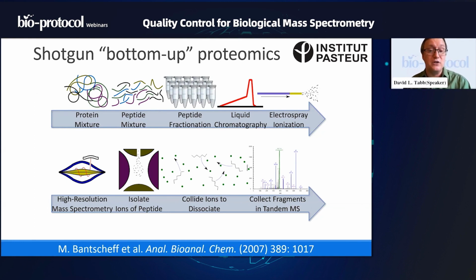And usually the trypsin reaction is around an 8-hour experiment or an overnight reaction. Once you've done that, you've gone from, let us say, a protein mixture of 10,000 proteins to something like 100,000 distinct peptides. We've made the situation worse, not better. However, peptides are a lot easier to work with in analytical chemistry than are proteins. So this more complex mixture in terms of numbers of different molecules represented is going to be easier for us to deal with at the stage of fractionation, liquid chromatography, electrospray ionization, and everything else that appears on screen here.